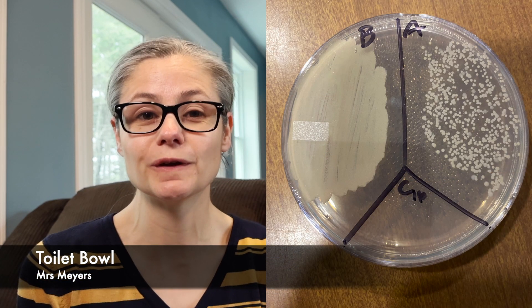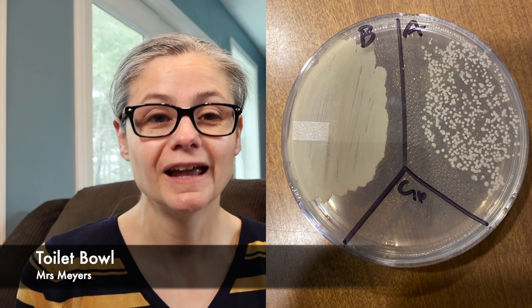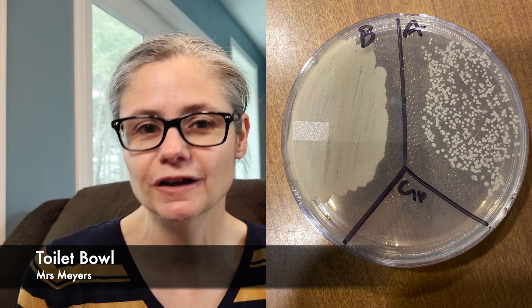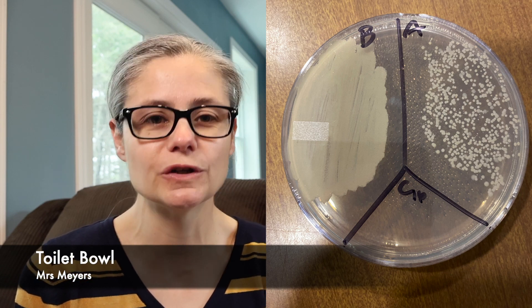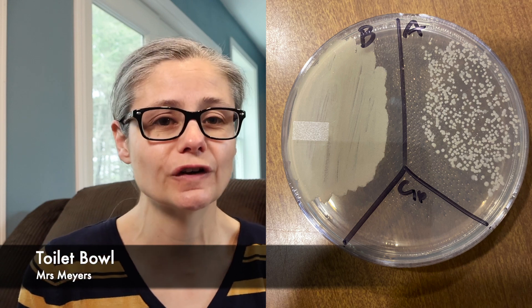Now for some results. In the before section, we can see a ton of bacteria, which is what we expect from a toilet bowl. In the after section, we can see a visible decrease in bacteria. We don't see a hugely significant decrease, but there most certainly is a decrease. So Mrs. Meyers does an okay job at removing bacteria from my toilet bowl, even though it makes no claims to even be able to remove bacteria.